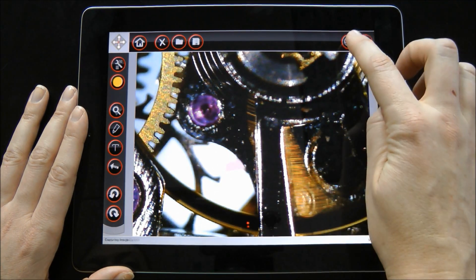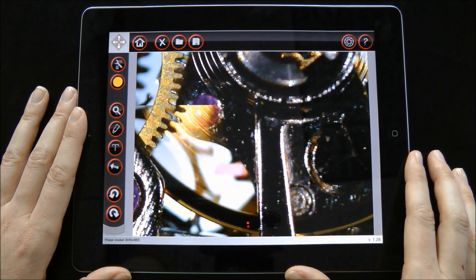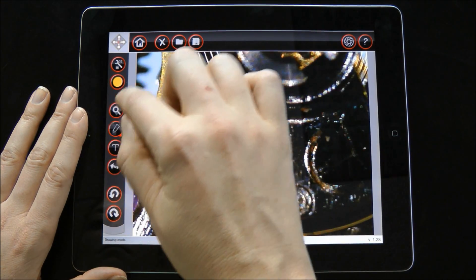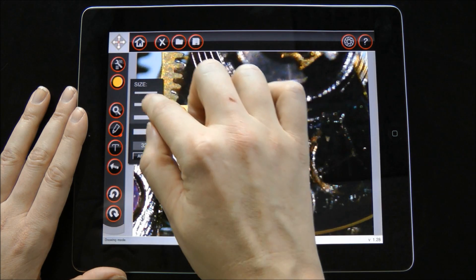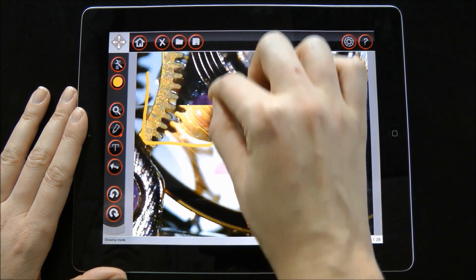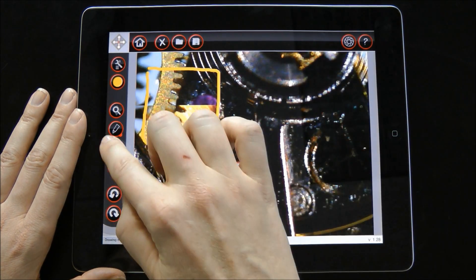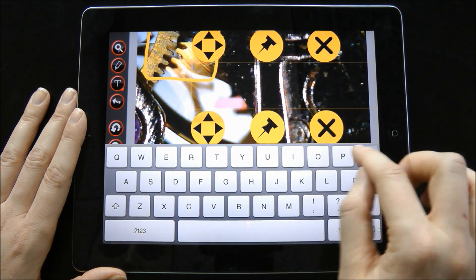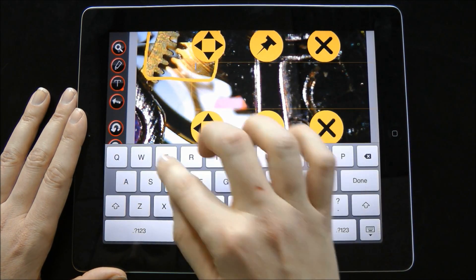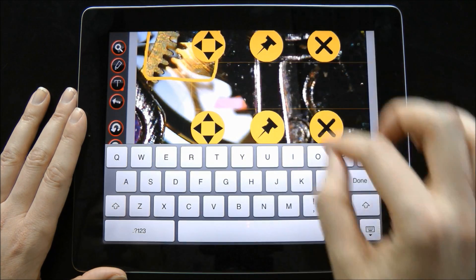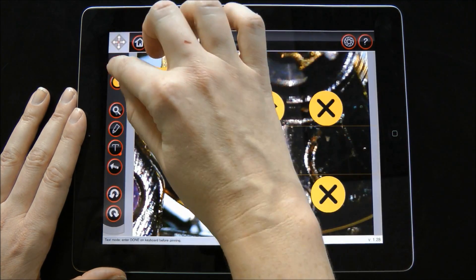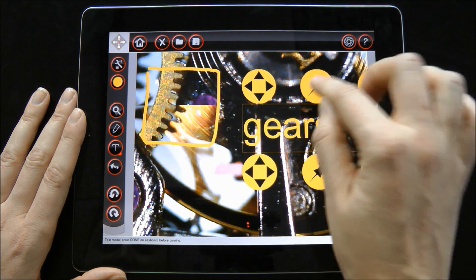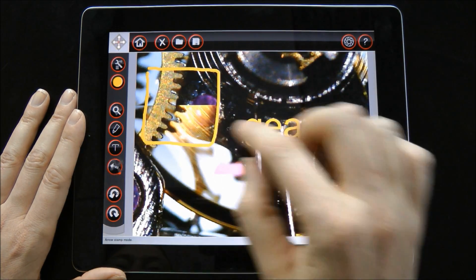To capture an image, press the Lens tool. Annotation tools include drawing, text, and arrow tools.